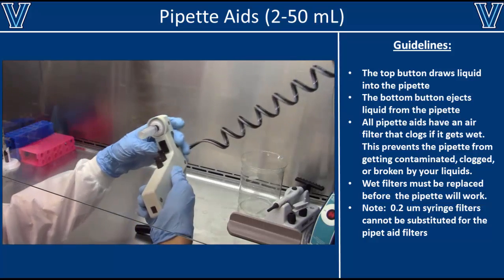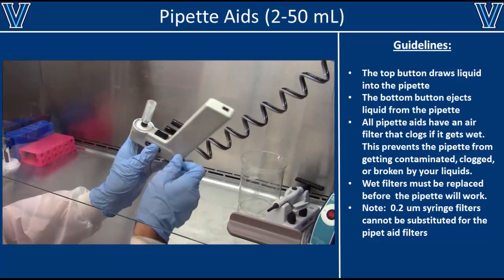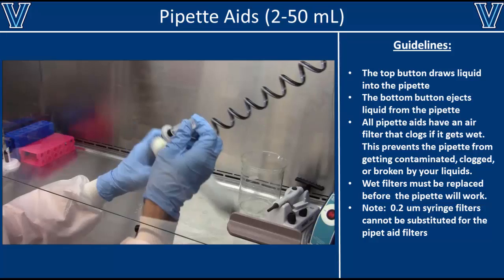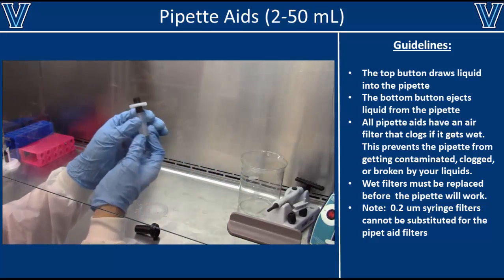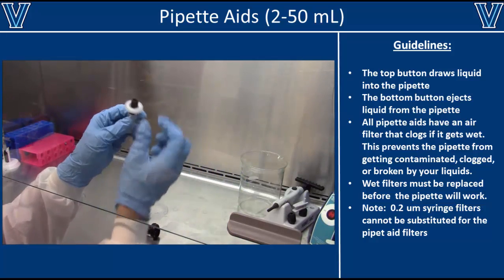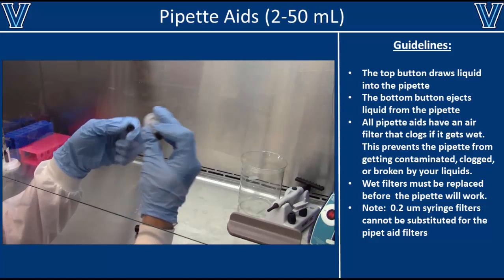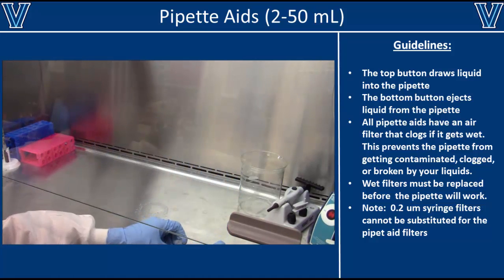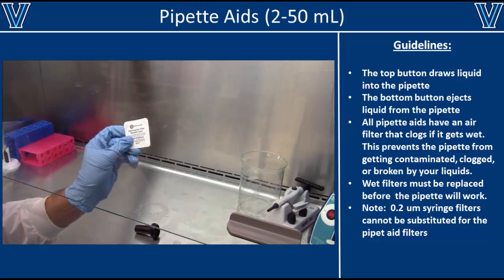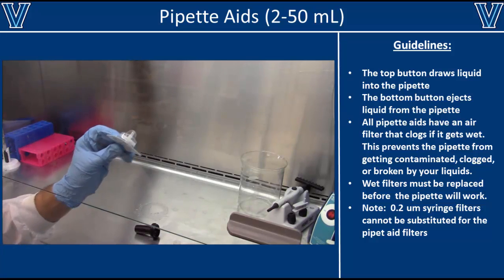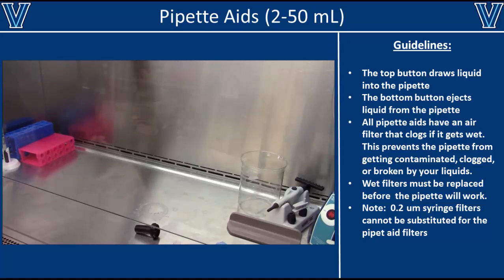Therefore, to get the pipette aid working again, you'll have to disassemble the pipette head and remove the clogged filter, as shown here. Once you've removed the clogged filter, you'll need to replace it with a new filter. Note that syringe filters designed for liquid will not work properly in a pipette aid. You must use the air filter specifically designed for your pipette aid.